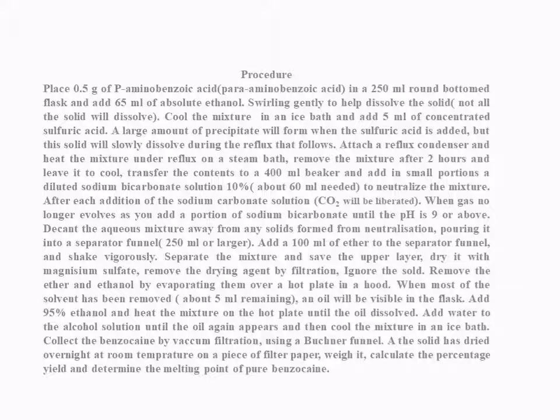Set your reaction up with a reflux condenser and heat the mixture under reflux on a steam bath. Avoid using fire because you have a flammable solvent, which is ethanol. Remove the mixture after 2 hours and leave it to cool.